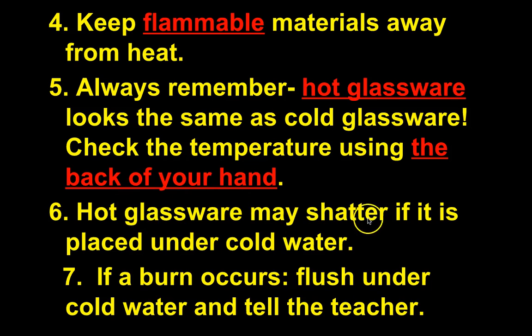Hot glassware may shatter if placed under cold water. If you finish a lab with boiling-hot glassware, use the gripper to dump the water but don't rinse it with cold water right away — it could shatter, and if you break it you'll have to pay for it. If a burn does occur, flush it under cold water and let me know. Ice doesn't really help. For a serious burn we may need to send you to the office or even the hospital.